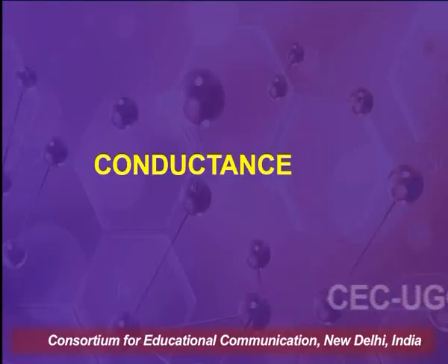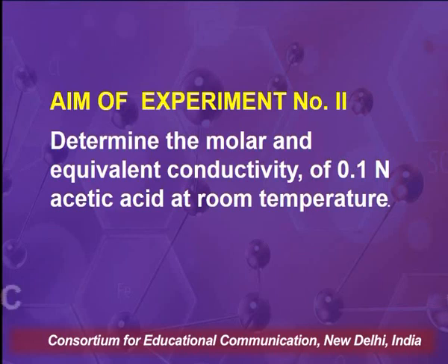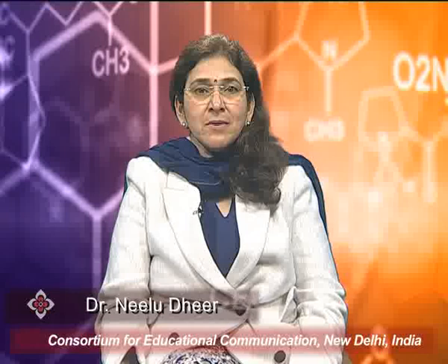The topic of my series today is conductance. Let us begin with experiment number 2. The aim of the experiment is to determine the molar and equivalent conductivity of 0.1 normal acetic acid at room temperature. In our previous experiment, we had determined the cell constant.